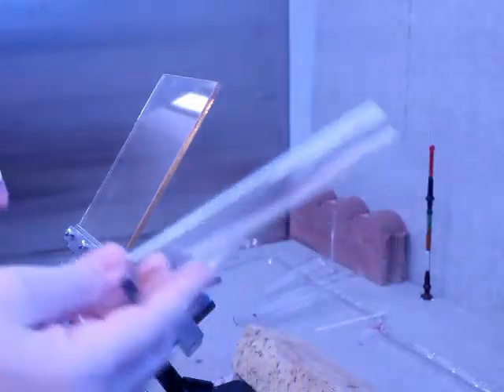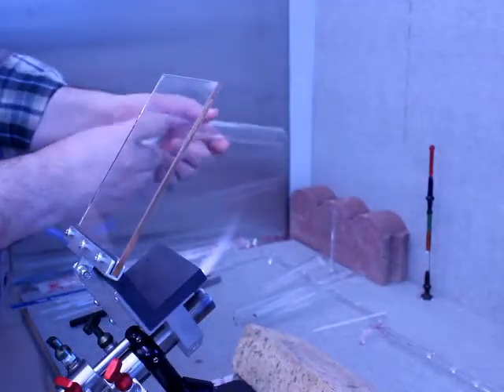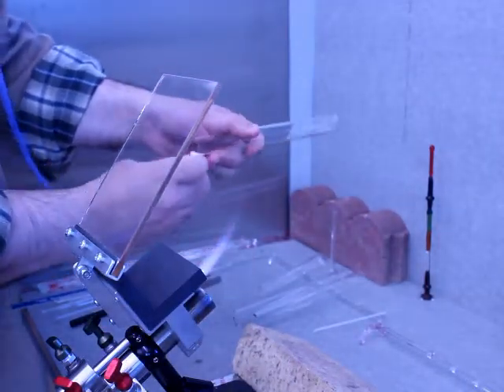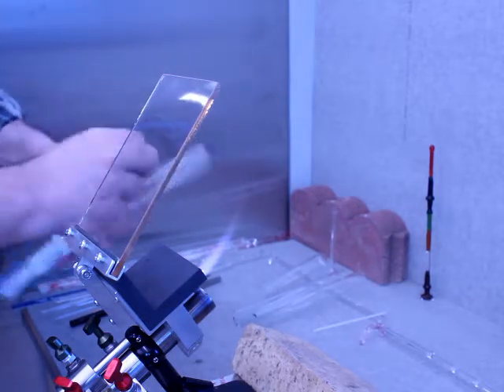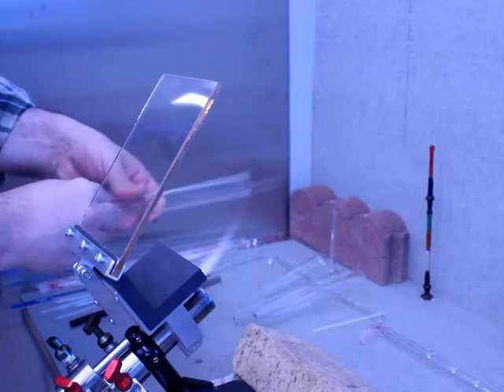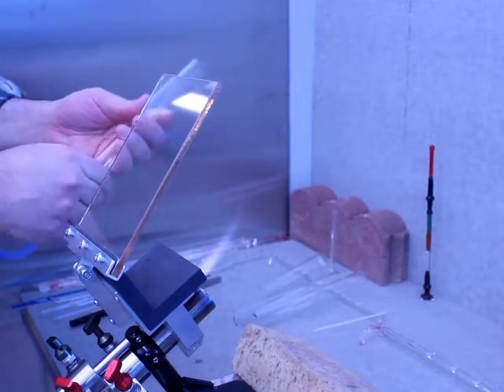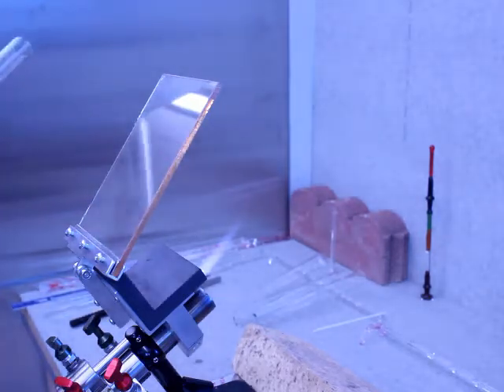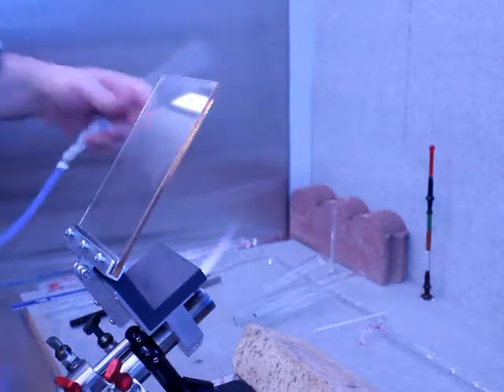So I've got my blank, and I'm going to convert it into a test tube, or a round bottom, as it's sometimes called. In this case, I am hooking up a blow hose to it. That's really not necessary. The end is fire polished, so I could blow directly into it. But what I found for me personally, in this kind of situation, having control with the blow hose does help.